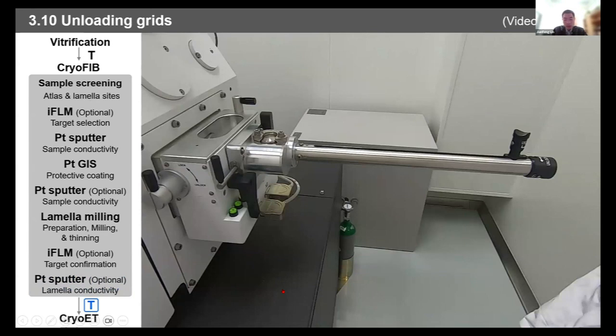So now after you get the good lamella, it's ready for you to transfer the sample out of the cryo-FIB machine. The transfer rod is still docked on the cryo-FIB machine, because there is still vacuum, so your transfer rod is still clean and dry. So now you just press the button.